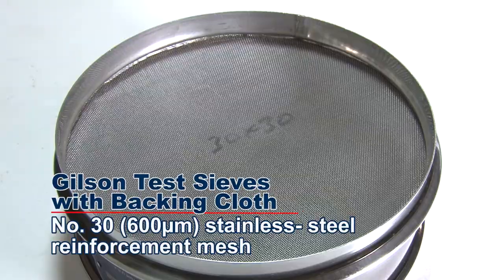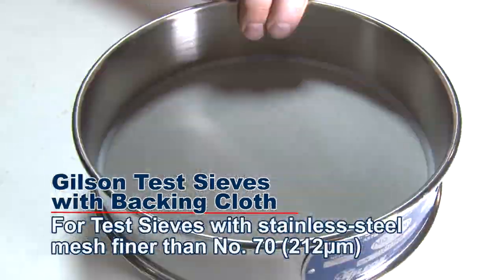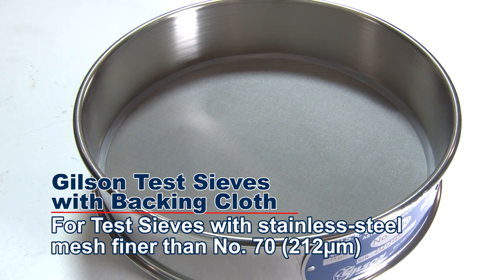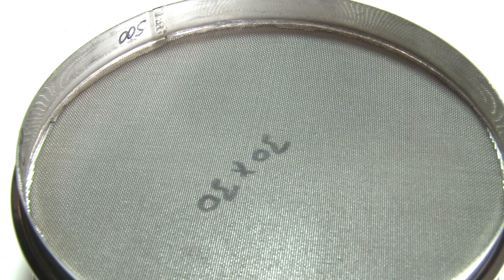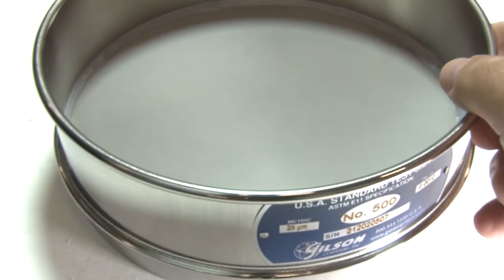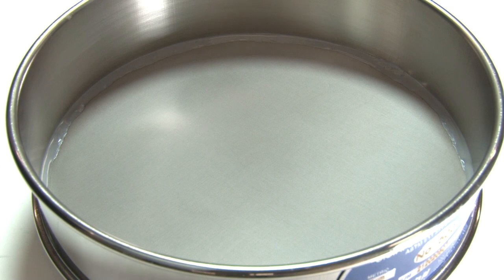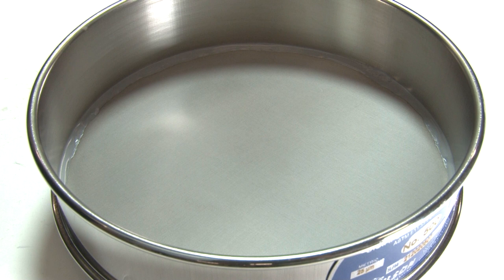The backing cloth is a factory-installed number 30 stainless steel mesh reinforcement for test sieves with stainless steel mesh finer than number 70. A number 30 stainless steel cloth reinforcement is added to the made-to-order test sieve just below the testing cloth, increasing the strength of the testing cloth and reducing distortion of the mesh openings, which may result in inaccurate test results.